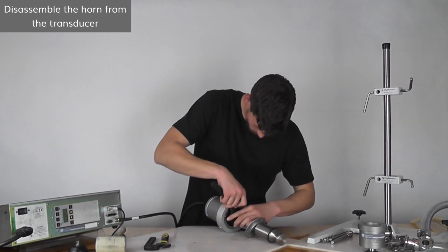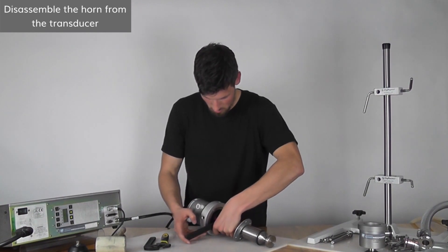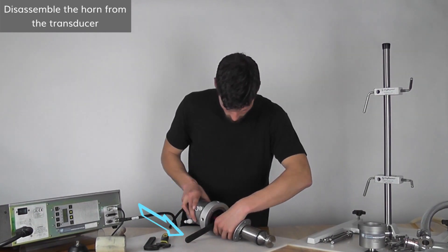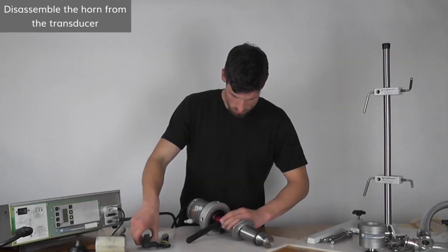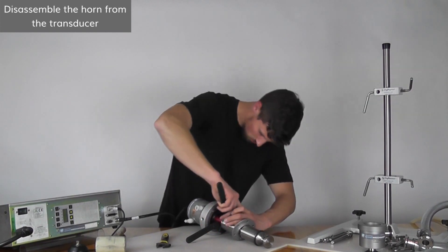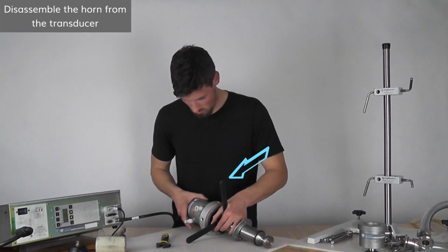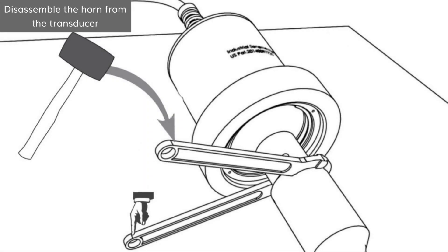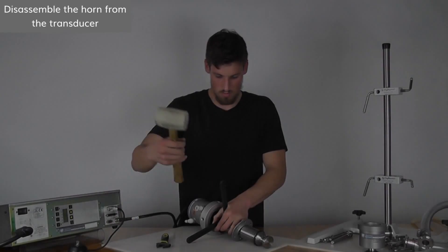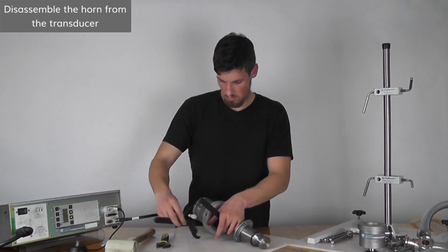Insert the pin of the first spanner wrench into a hole in the transducer's front mass and hold it against the work wrench to prevent counterclockwise movement. Insert the pin of the second spanner wrench into a hole of the horn's input end and set it up to provide counterclockwise torque. Tap the second spanner wrench to create counterclockwise torque while holding the ultrasonic stack in place with your hand.